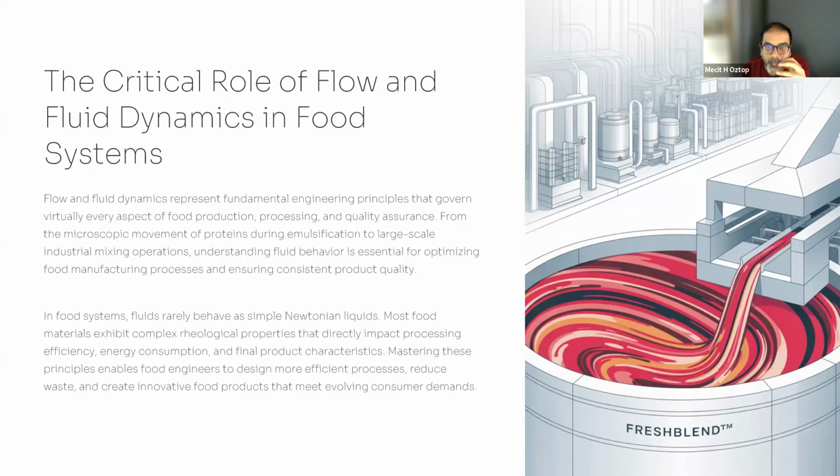Why? Because understanding fluid flow is important, since in a food processing plant we have pumps, pasteurizers, and evaporators, which all involve some form of fluid dynamics.